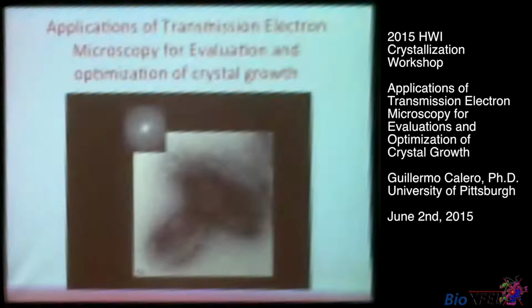Today I'm actually going to corroborate a lot of the things that you just heard, and I'm going to show you a couple of new ways to discover crystals and to find out possibly how well they will diffract. The title of my talk is Applications of Transmission Electron Microscopy for Evaluation and Optimization of Crystal Growth.